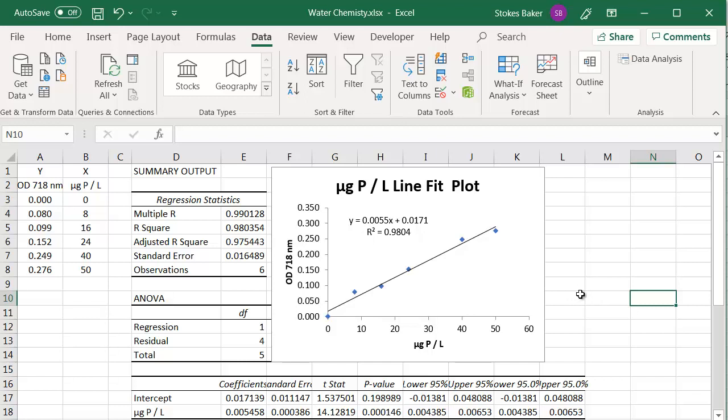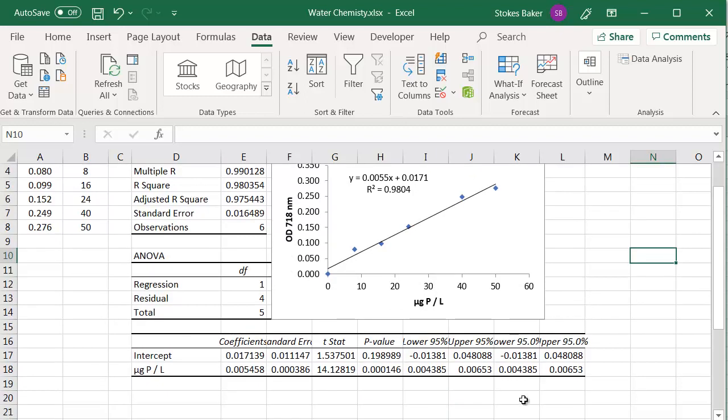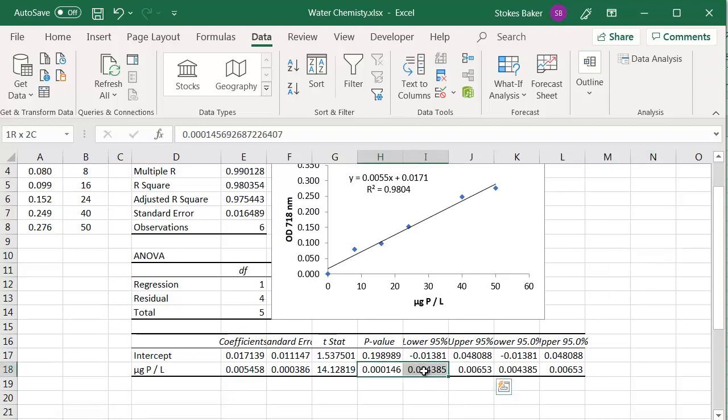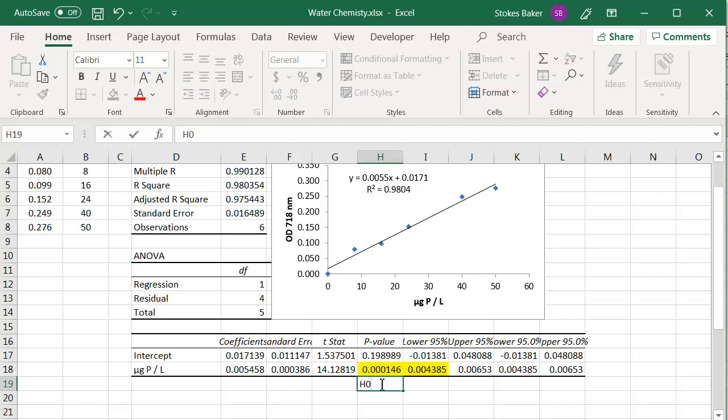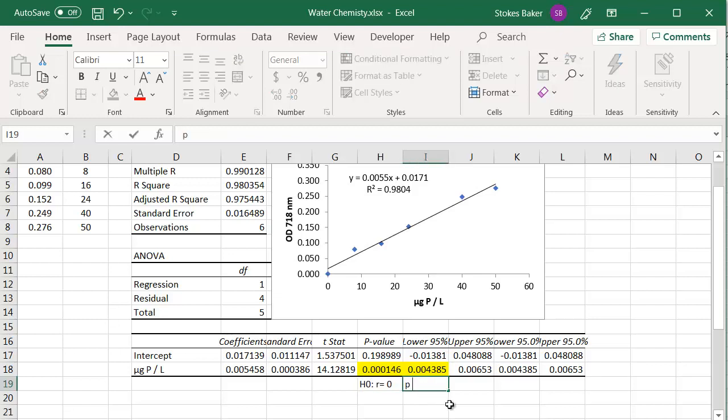First question is, is that regression line statistically significant? So to determine that, we're going to look at these two values. And for that, our null hypothesis is going to be R equals zero. P is definitely smaller than alpha. And therefore, we're going to reject the null hypothesis. In this case, we are saying the regression line is statistically significant.